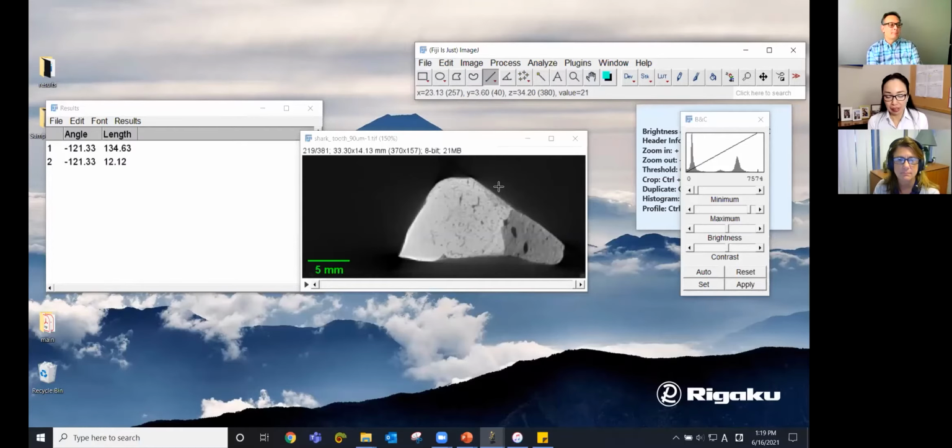That's a good question. Disclaimer: I'm not an IT guy, but I talked to an IT guy in the office about it, and it is open source. Anyone can add any plugins that would work in ImageJ, and I don't necessarily see a lot of regulation or control by the people who organize and manage this tool. So there is, at least technically, a risk that somebody might make something bad as a plugin to do some damage to your computer. I've never heard of it. I don't know if this audience is an attractive target for hackers.